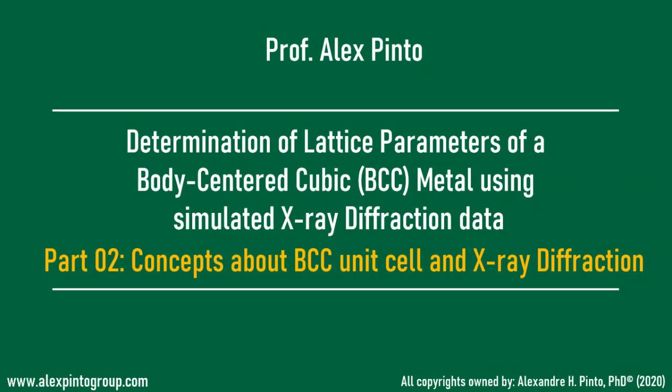Determination of lattice parameters of a body-centered cubic metal using simulated X-ray diffraction data. Part 2, concepts about BCC unit cell and X-ray diffraction.